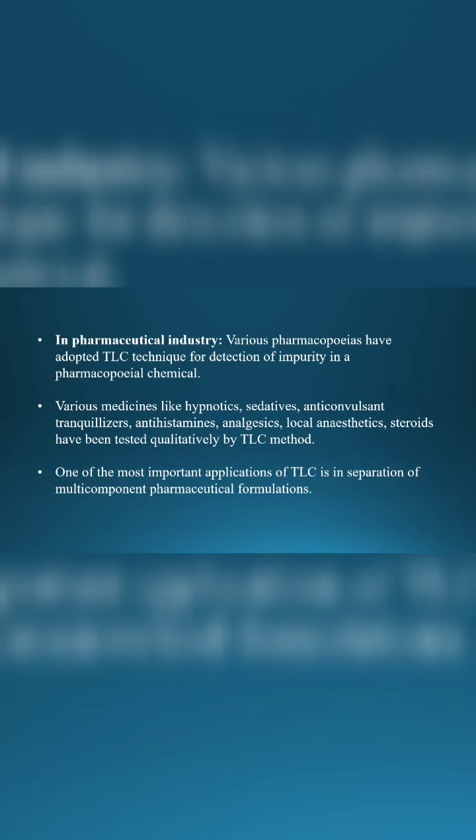In pharmaceutical industries, various pharmacopoeias have adopted the TLC method for detection of impurities in pharmacopoeial chemicals. Various medicines like hypnotic sedatives, tranquilizers, antihistamines, analgesics, local anesthetics, steroids have been tested qualitatively by the TLC method. One of the most important applications of TLC is in separation of multi-component pharmaceutical formulations.